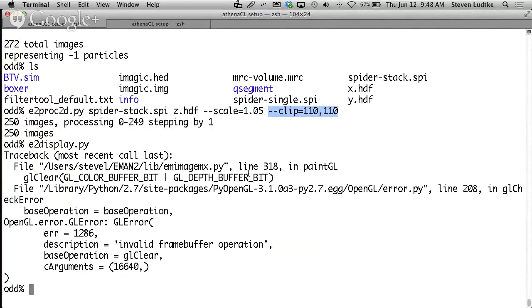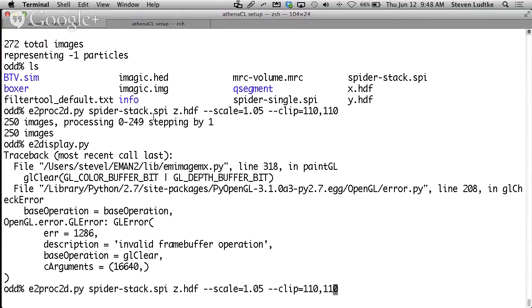When it made the box bigger, it just filled it in with 0 values. It didn't actually copy the image values. So it basically scaled the image and threw away a bunch of stuff at the edge, because the image got bigger, and then it made the box bigger and just filled it in with gray values. So if I want to scale an image up, I need to invert the order of those operations and put the scale second.